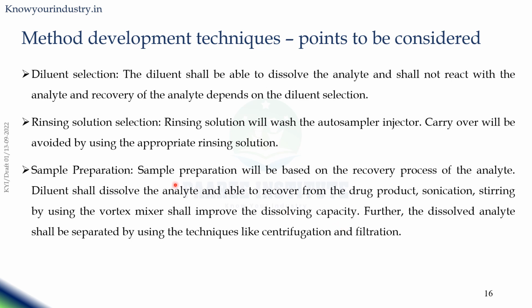In addition to dissolving the analyte with additional instrumentation or techniques, you can separate the dissolved analyte using other techniques like centrifugation and filtration. So basically, for sample preparation, you take the matrix, put it in the diluent, and then you use a mixing process like sonication, stirring, vortex mixer, or any other mixing process.